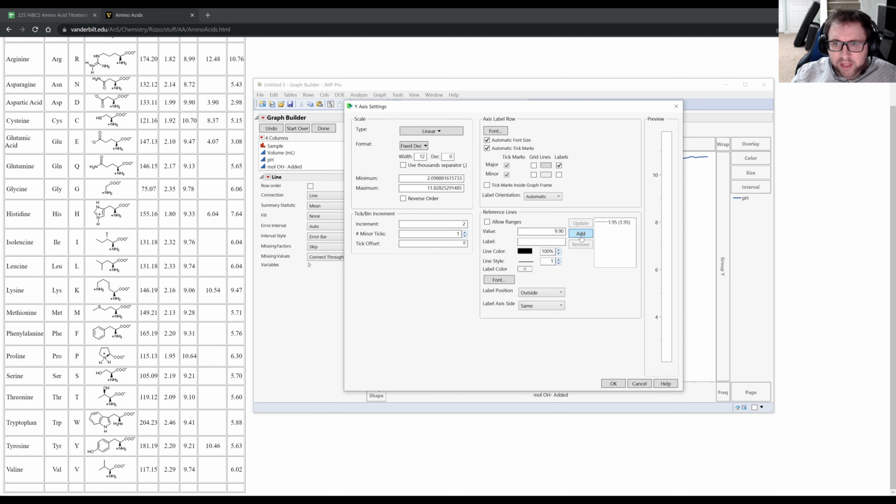That's fine. We tested that in TA training, and it makes your life way more difficult, so it's not worth it. All right, and then here's one graph. So file, export, probably want to shrink this down a little bit so that it's legible when you put it in your final product. And then it's really not too bad.